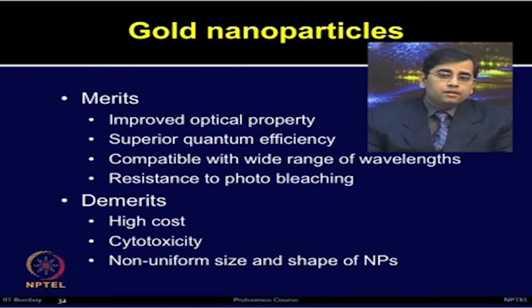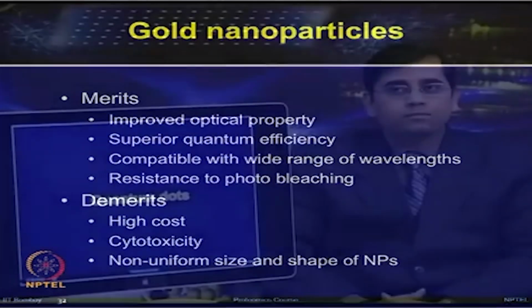Systematic cytotoxicity studies should be performed if we want to use these gold nanoparticles for a variety of applications, including protein microarrays. So, high cost, cytotoxicity, and the non-uniform size and shape of the nanoparticles are some of the limitations of using gold nanoparticles as a sensitive detection platform for microarray based applications.